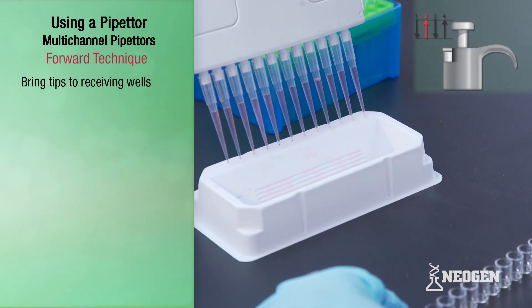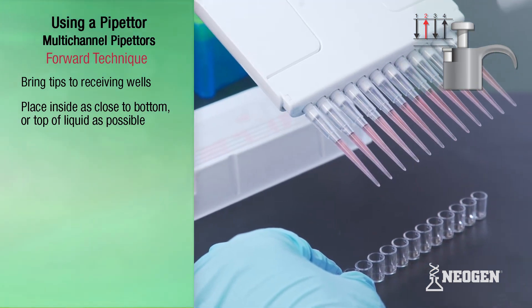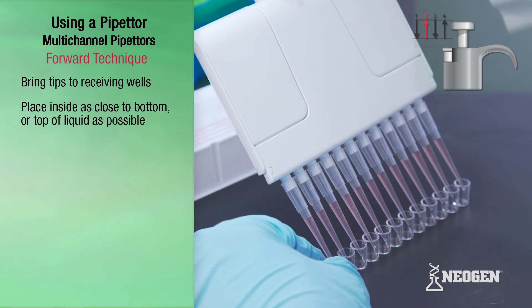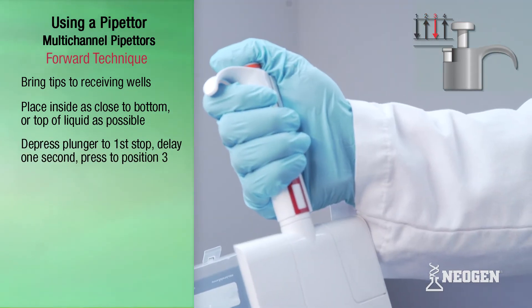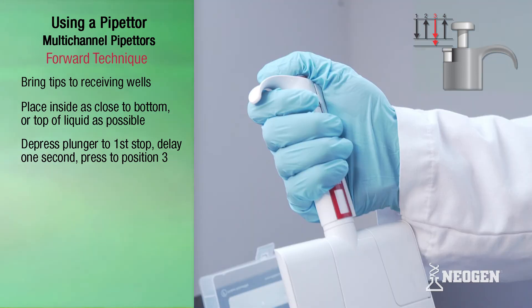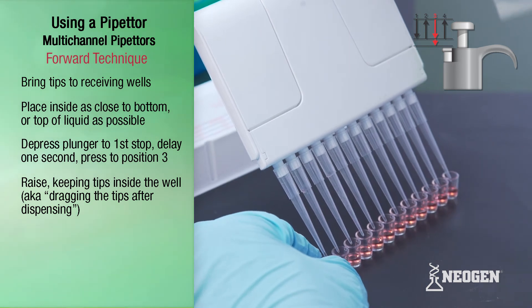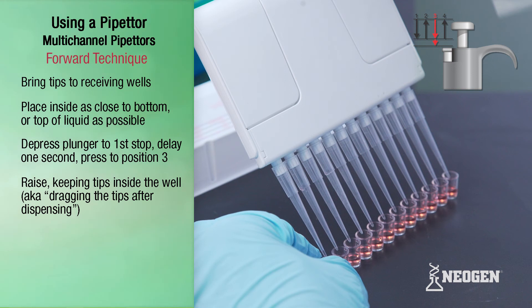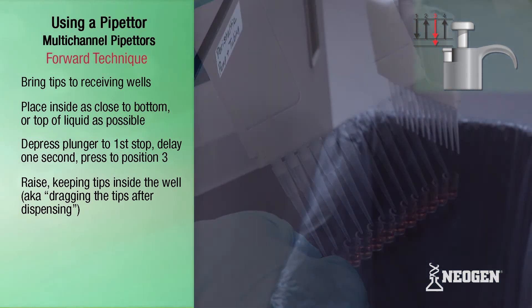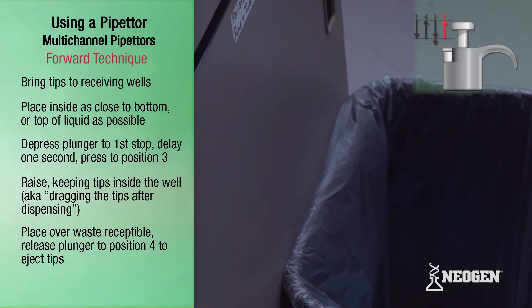Bring the pipetter with filled tips to the receiving wells and place the tips against the inside walls of the wells as close to the bottom or as close to the top of any existing liquid in the vessel as possible. Slowly depress the plunger to the first stop of position three. After a delay of one second, continue to depress the plunger all the way down to position three — this action empties the tips. While holding the plunger all the way down, slowly raise the pipetter while keeping the point of the tips against the inside wall of the wells; this is known as dragging the tips after dispensing. Next, position the pipetter with tips over a waste receptacle, release the plunger knob to position four, and eject the tips.